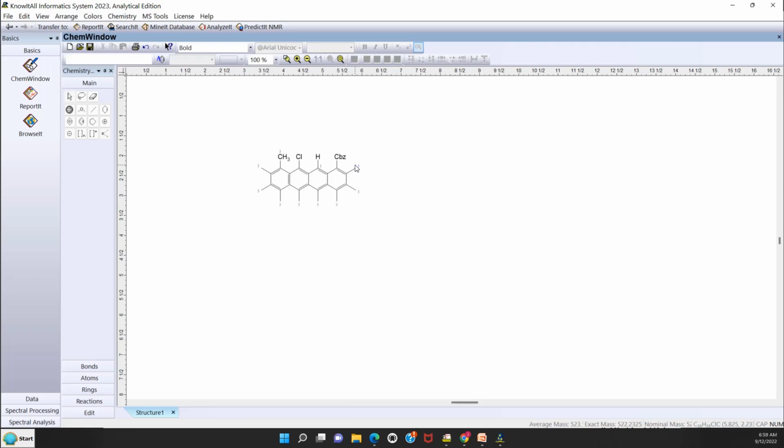Let's go down and try phosphorus, which you just type the P on your keypad. And again, you can click on that by just continuing to type P. It keeps stripping the hydrogens off if you want to do that. Let's come down to the next one and now hold the Shift key while we type P, and you get a phenyl group, which is somewhat useful. Let's go and do an S. Imagine you'll get sulfur for that. And you do. You get the SH.